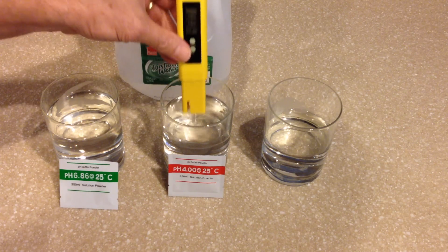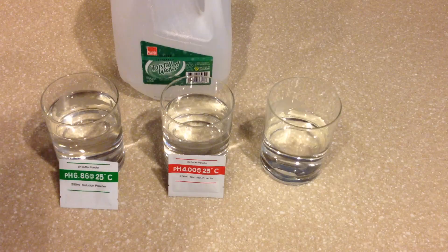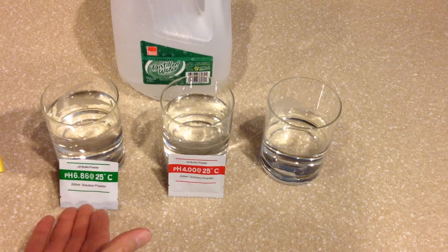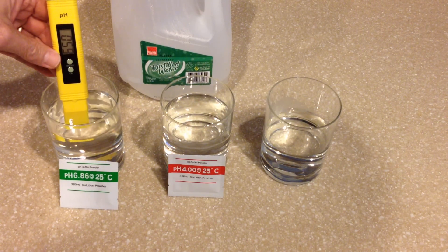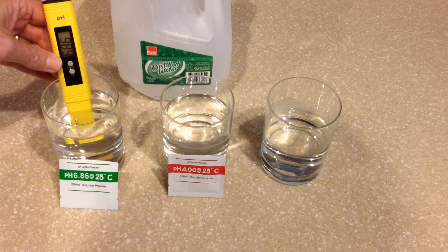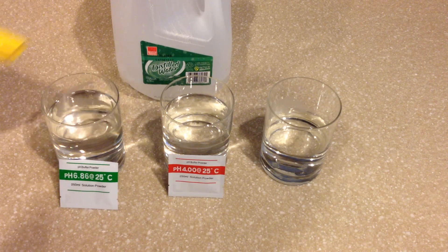And there it stopped — it stopped at 3.99, as you could probably see. I'm simply going to rinse it off and it's completely done. It's that simple to calibrate. If you want to test it, you can simply put it back into the 6.86 solution without pressing any buttons and see what it reads. Let's just stick it back into the solution here and let the reading hold — and as you can see, it's reading 6.86. It's perfectly calibrated.